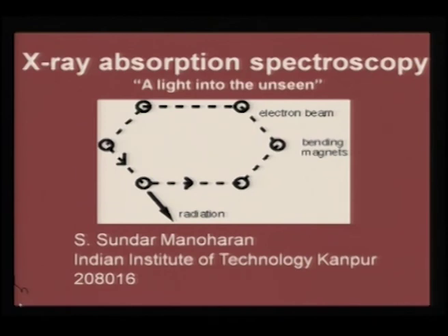There we highlighted that XPS is a very good surface analysis tool, where surfaces up to 10 nanometers thick can be studied in greater detail. It talks about the impurities that can occur in the surface, how we can probe the different metal ions that are present, and also the characteristic X-ray that is coming out.